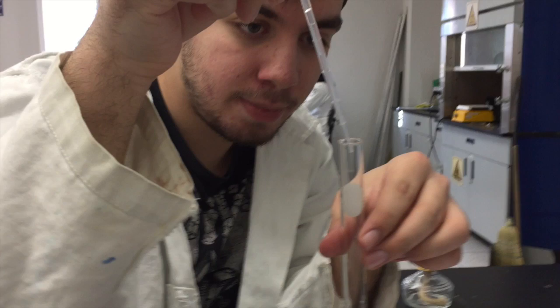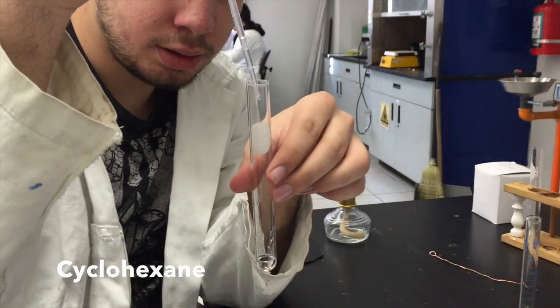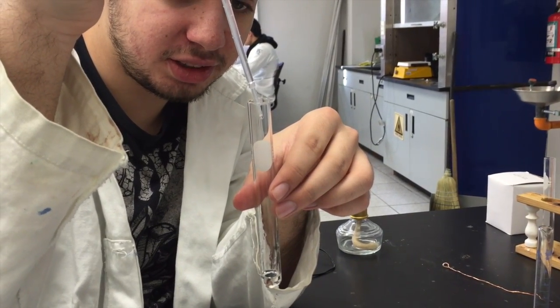Afterwards, we did the solubility test, and we did this by adding 20 drops of water to each test tube. We found out that none of them are soluble.